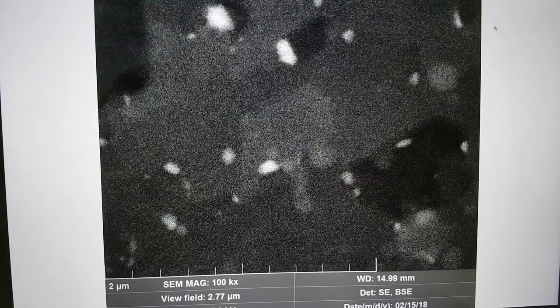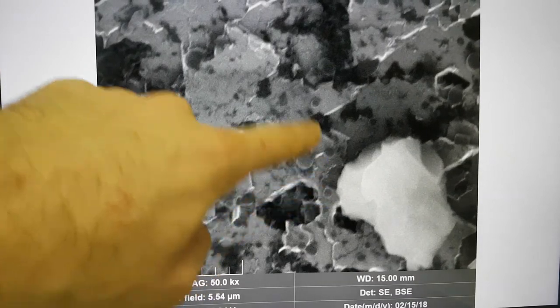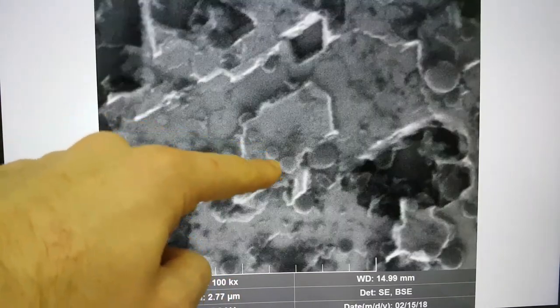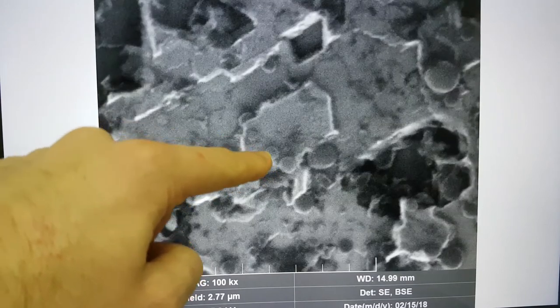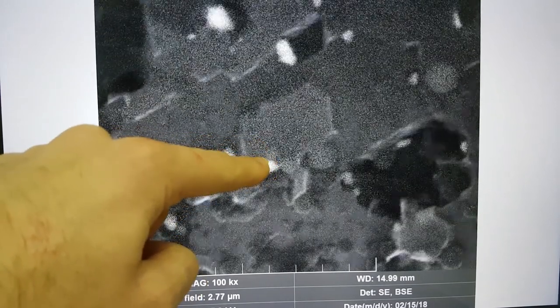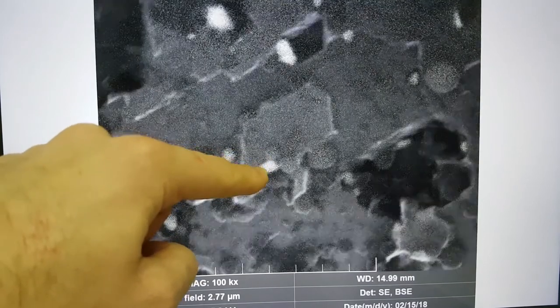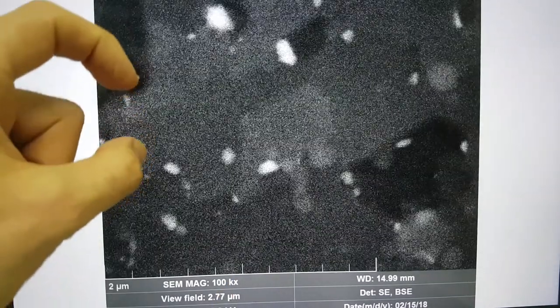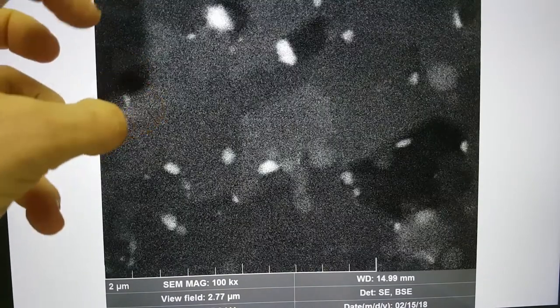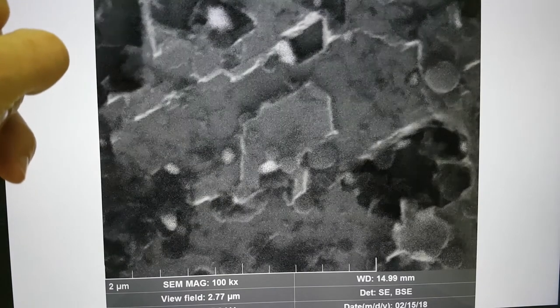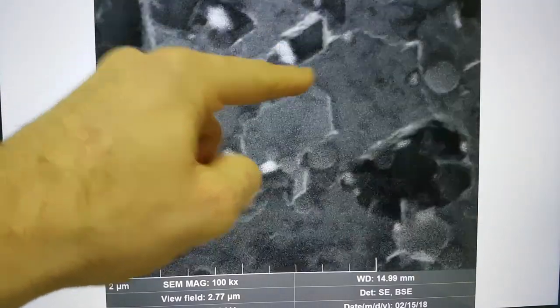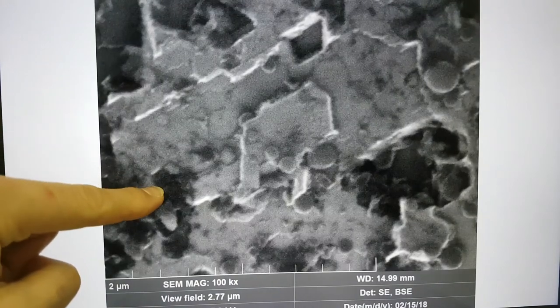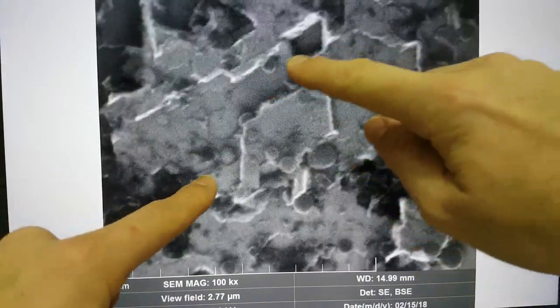Even closer. This is really close in. We're zooming into this kind of area here. You can see here, essentially look, we have these spheres. When it goes to the backscatter image, you almost can't see them, which suggests they are mostly carbon. Totally fascinating to me how these blobs appear. Maybe these are the kind of black spheres we're seeing in the color microscope images. What are these blobs? It looks like it's eaten out this channel and left it in here. In this case, it's eaten out this channel and left it up there.